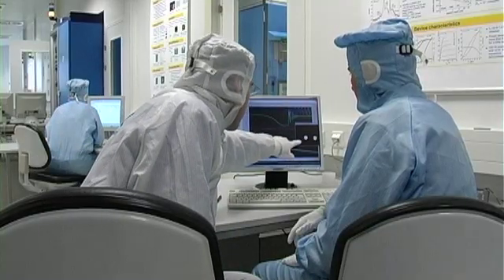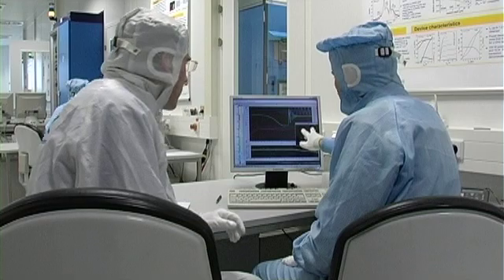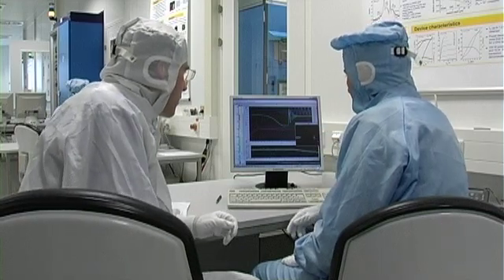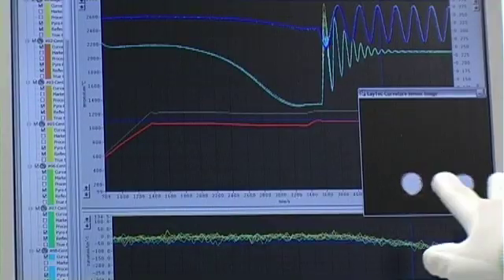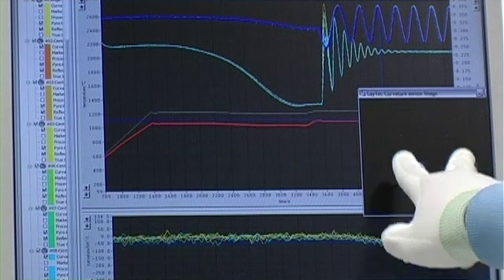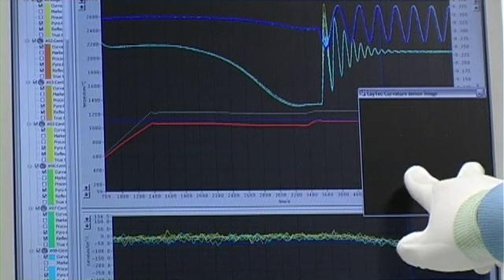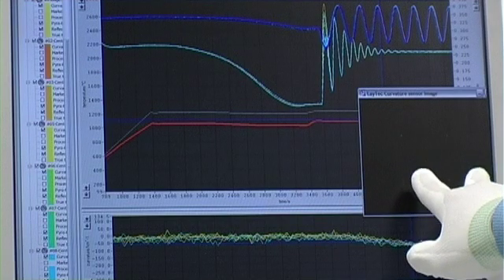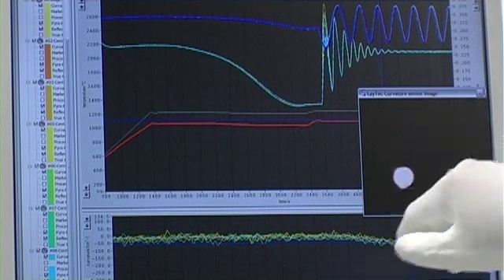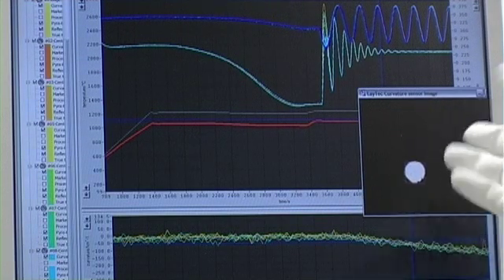And this window here, why is this particularly interesting for you? Here we see the laser spots of the curvature measurement. These two spots have a certain distance, and this distance is measured and is calculated to the curvature. And the movement of these spots gives us information about the wobble substrate.